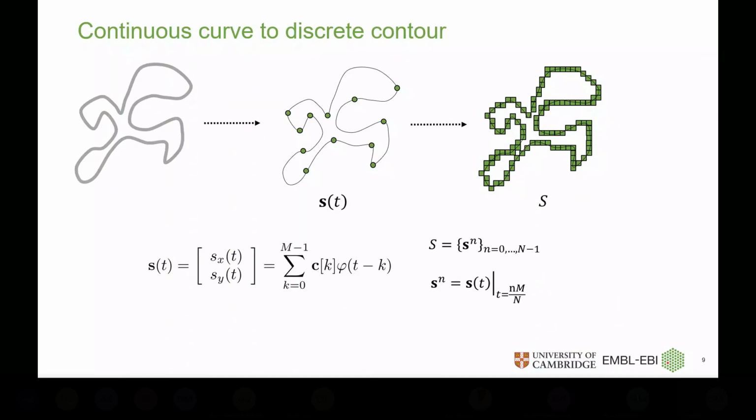What is very crucial to note here is that the shape parameters that we are getting out of the network are a bunch of control points. Using these control points, we get a continuous description of the contour. But the ground truth that we need to use to train the model is a bunch of discrete pixel masks, right? These ground truths are a bunch of pixel values living on a discrete grid.